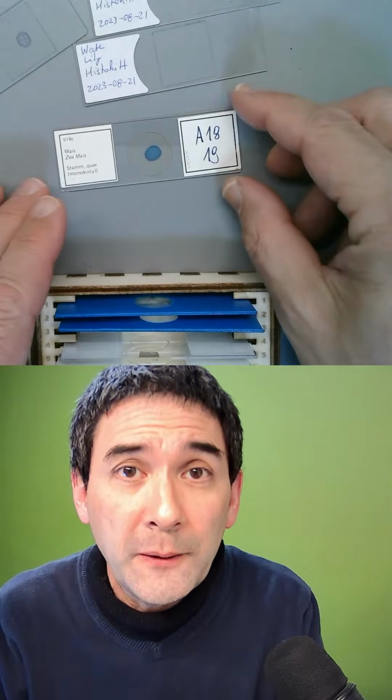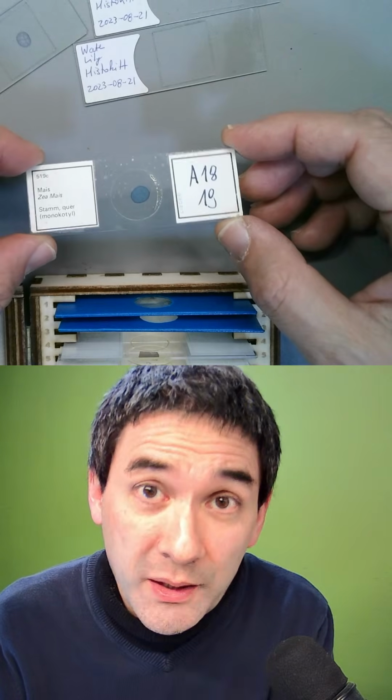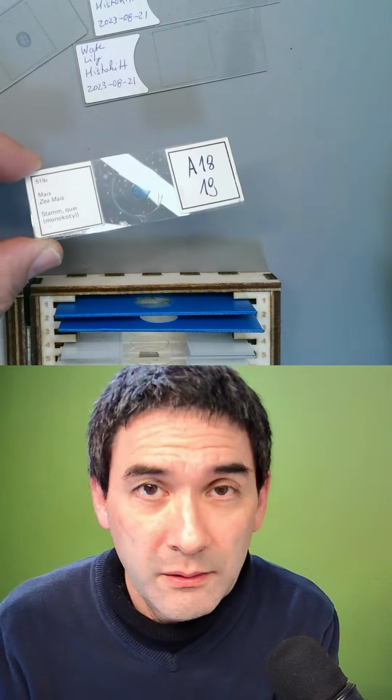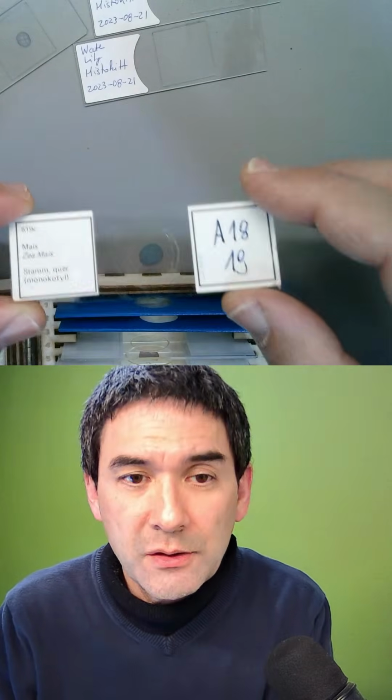lieder.de. It's a German company. You can download the catalog, and they even manufacture slides based on your own requirements. Some of the slides can be quite expensive, and if they don't have it, I don't know who's got them, honestly. So let's have a look at those.